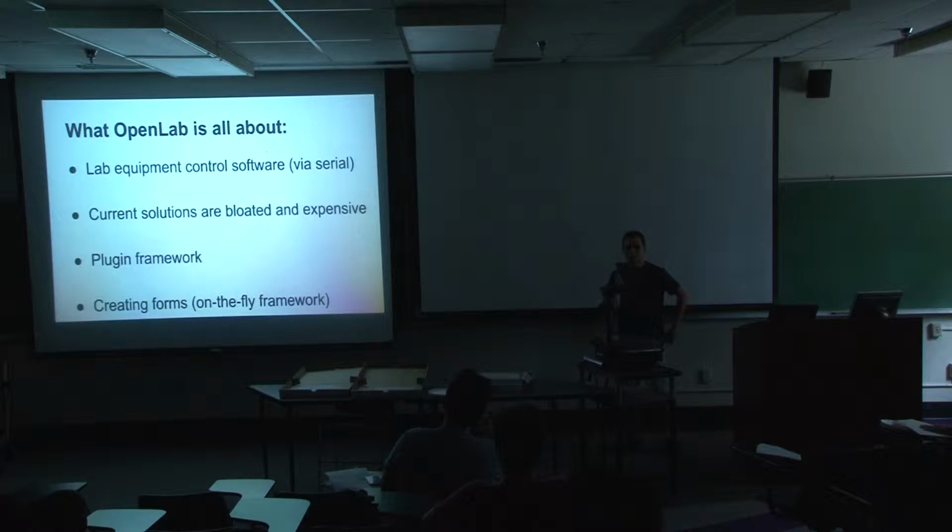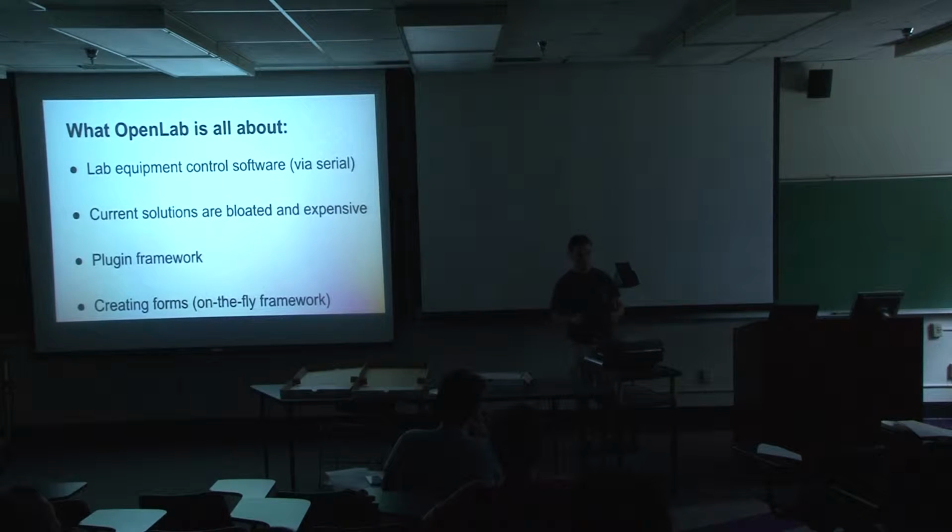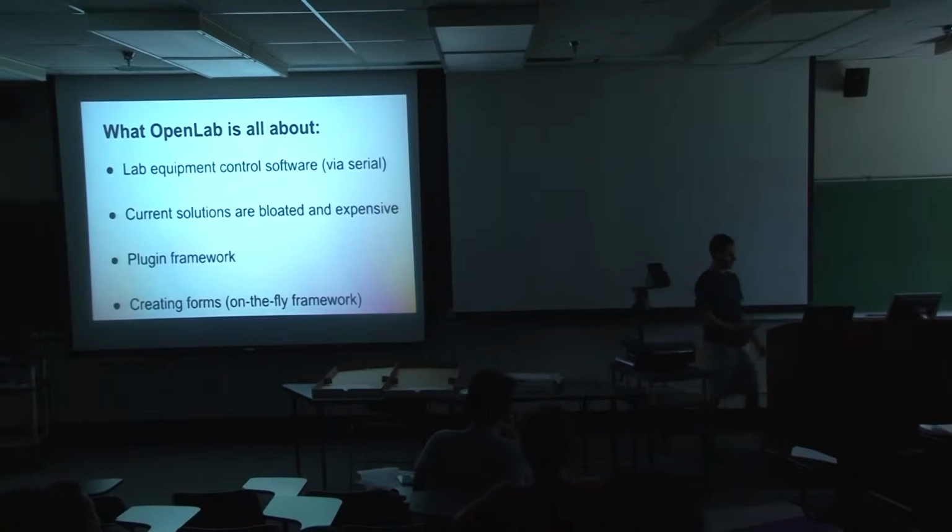Currently working on serial, although hopefully I'd like to have a couple other plugins that people could do. And as I mentioned before, LabVIEW and other stuff, I've heard it's a total nightmare to program. It's also pretty expensive. The idea for this project would be to implement a plugin framework. So we would have plugins that other people could write, or I would write a core set and put them out there, and if someone needed to run a certain piece of equipment and needed something that wasn't already implemented, they could write it, and we'd have a plugin repository that people could contribute to, and it would grow a community, is the idea.